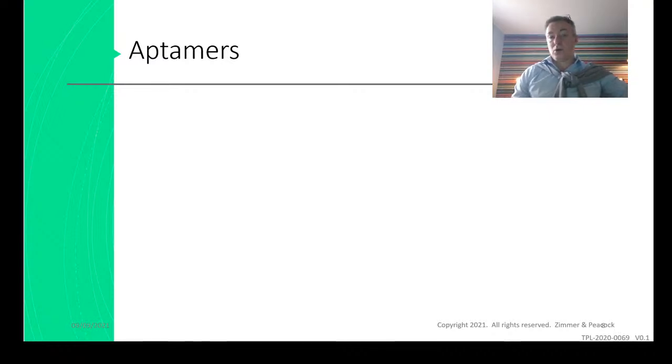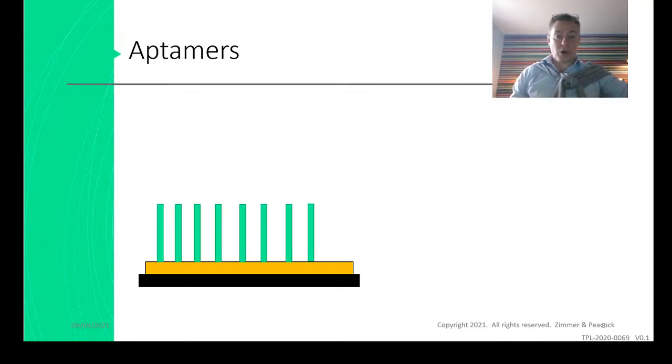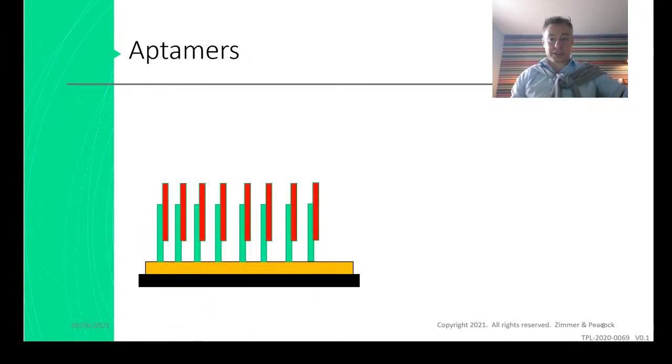We had another question from Phil Wong, and I think Ali did reply to this, and that's what I appreciate, because the ZP Developer Zone is really a way of helping people with their problems. So with Phil, I think what's happening here is he's got an electrode, he's putting the aptamers on it, and he's reporting to us, I have an electrode, I measure the impedance on my electrode, I put the aptamers on there, there's a big change in signal. So that convinces him that he's put his aptamers onto the surface. Good. Now, when he's reporting the capture, obviously you put an aptamer on there because you want to detect another molecule, and you detect it through the capture.